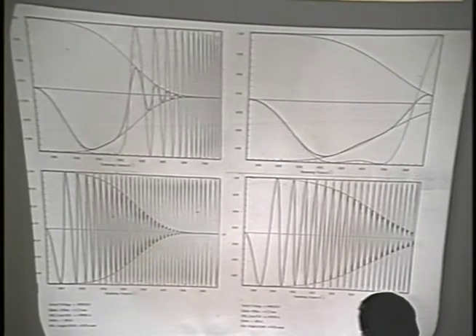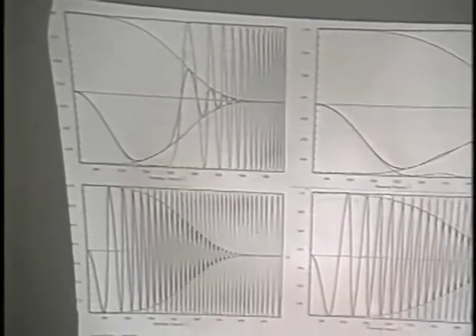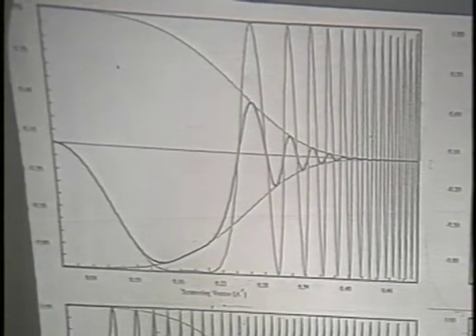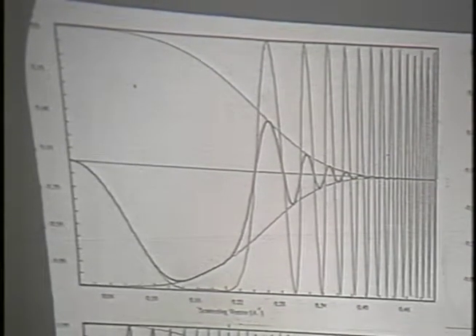This looks backwards from here. It's not backwards at all. On the top here is the situation for the first picture I drew, where you sort of have the proper focus for resolving out to the highest resolution at 100 kV. Now, the focus where you get this wide range of the proper phase shift is known as Scherzer focus.